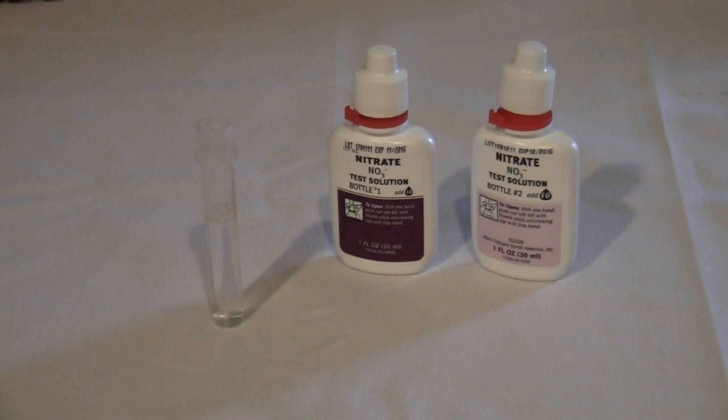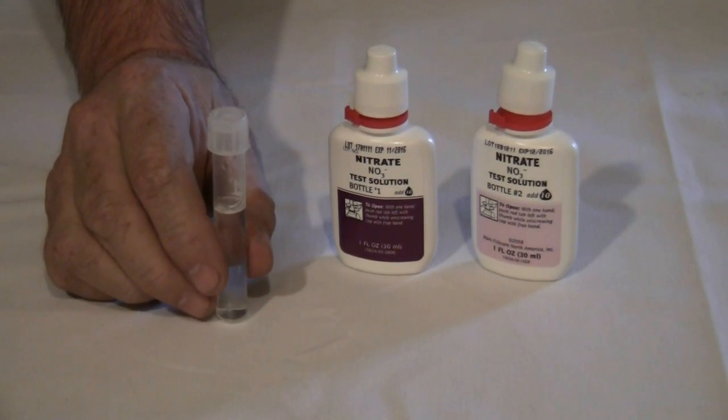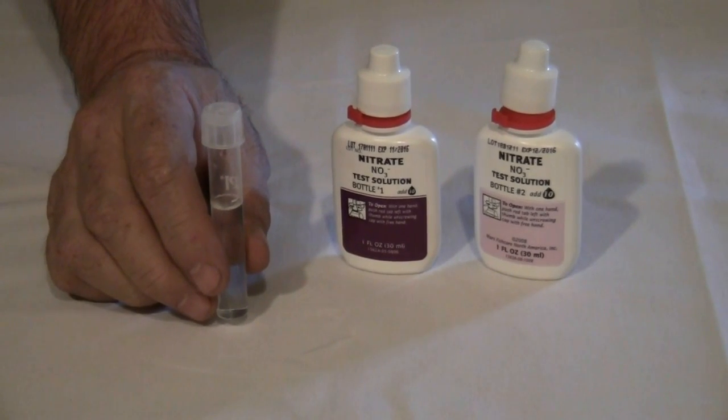For our last test, we are going to test for nitrates using a chemical method known as color comparison. As with all test kits, follow the manufacturer's directions to ensure accuracy. Take a sample of water and place it in the vial. Most test kits provide vials for testing purposes.